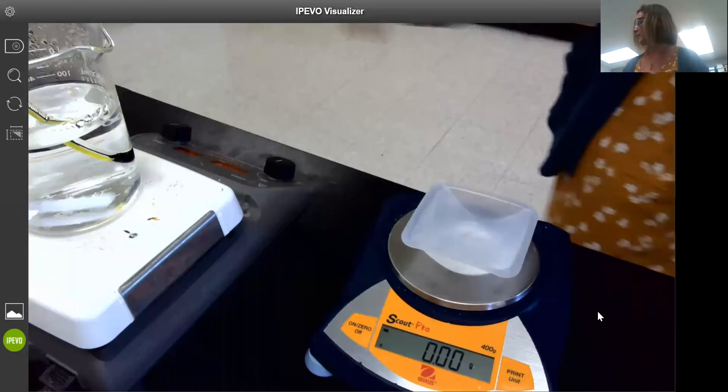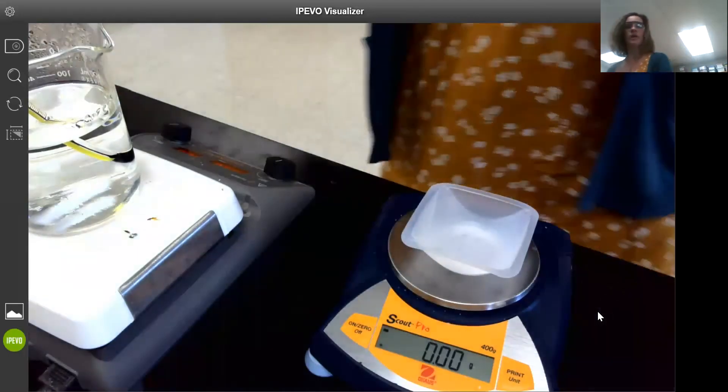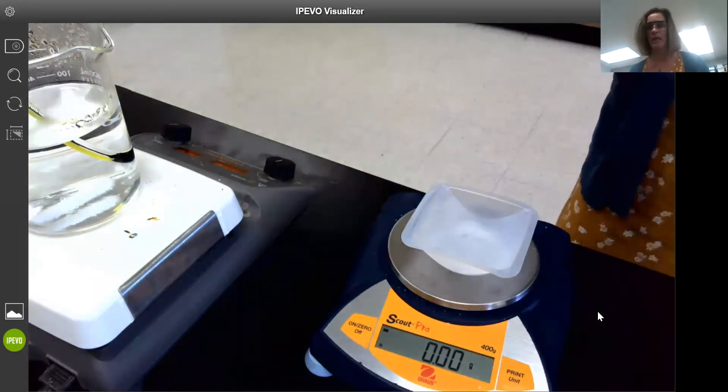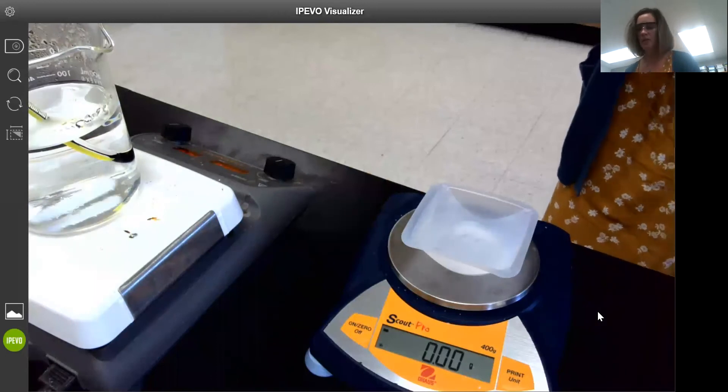Please carry out that calculation to determine the amount of KMnO4 required. I determined that 1.58 grams of KMnO4 is needed to make up an approximately 0.02 molar KMnO4 solution, so I'm going to mass that out on the digital balance to the nearest 0.01 grams.